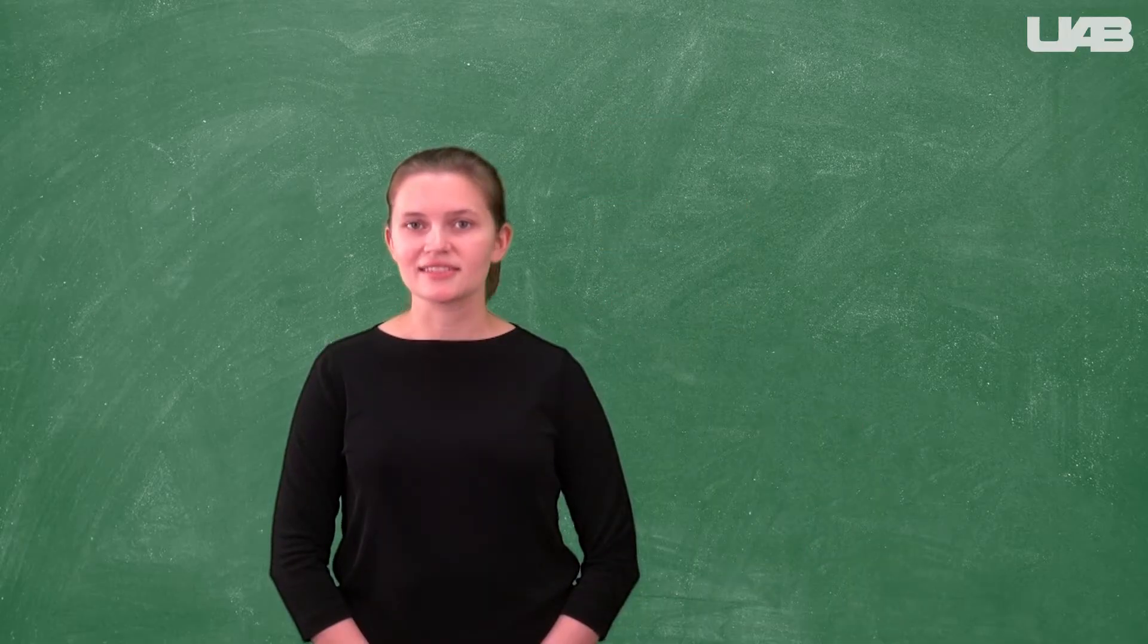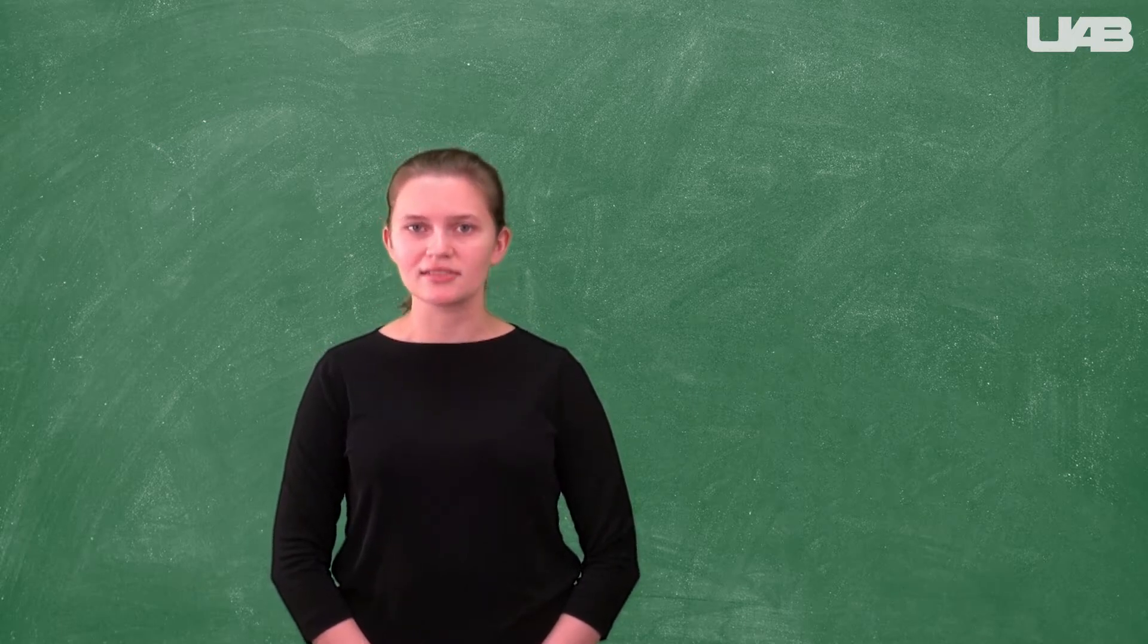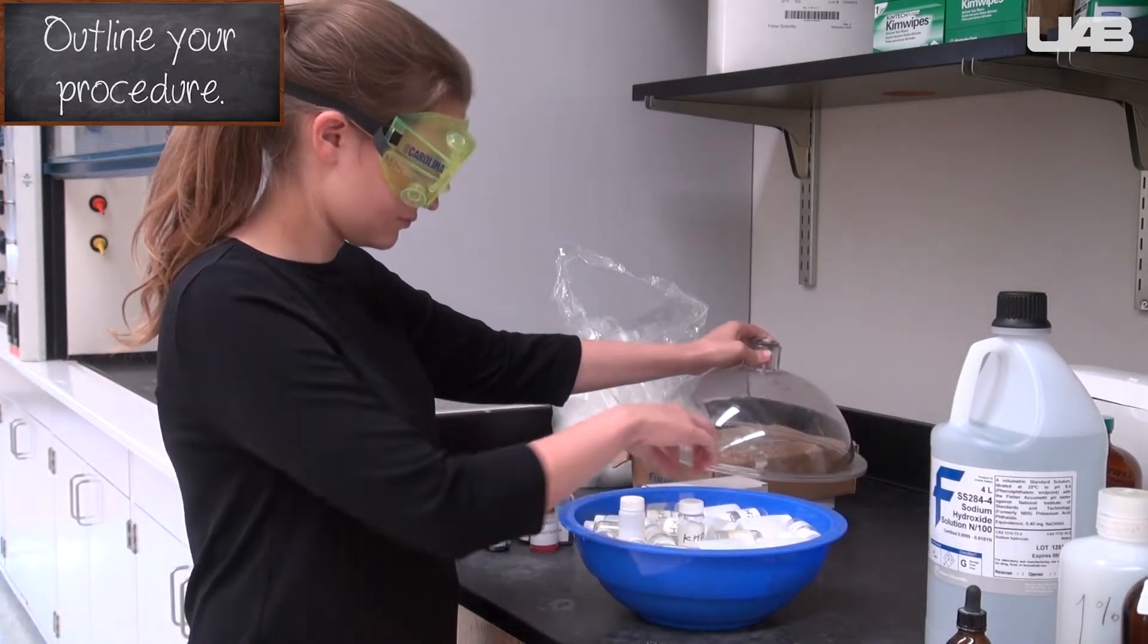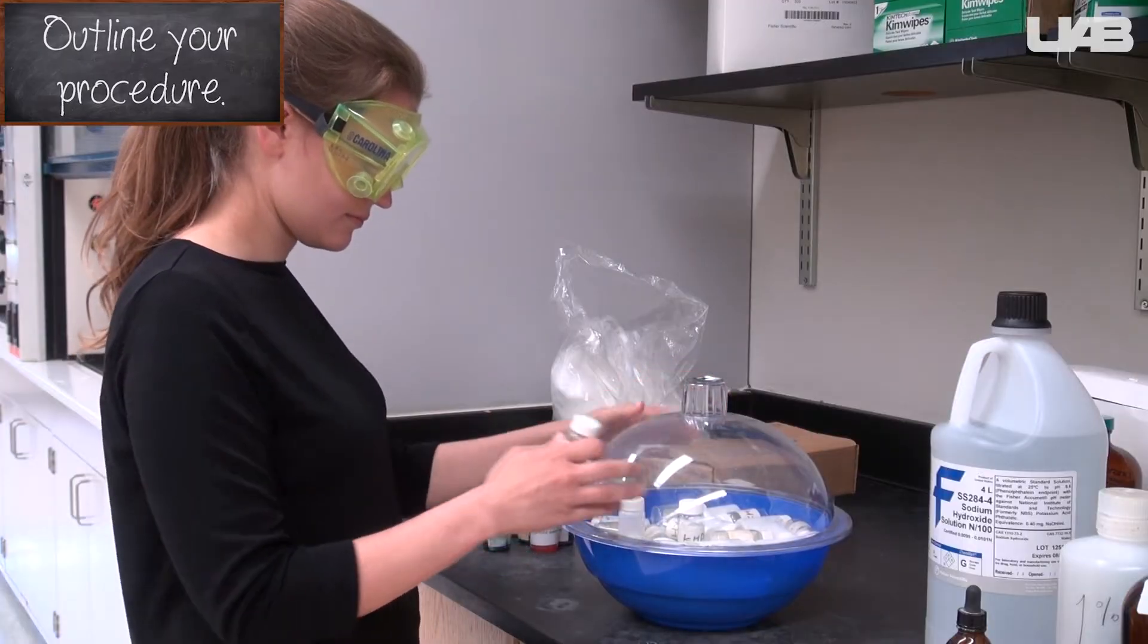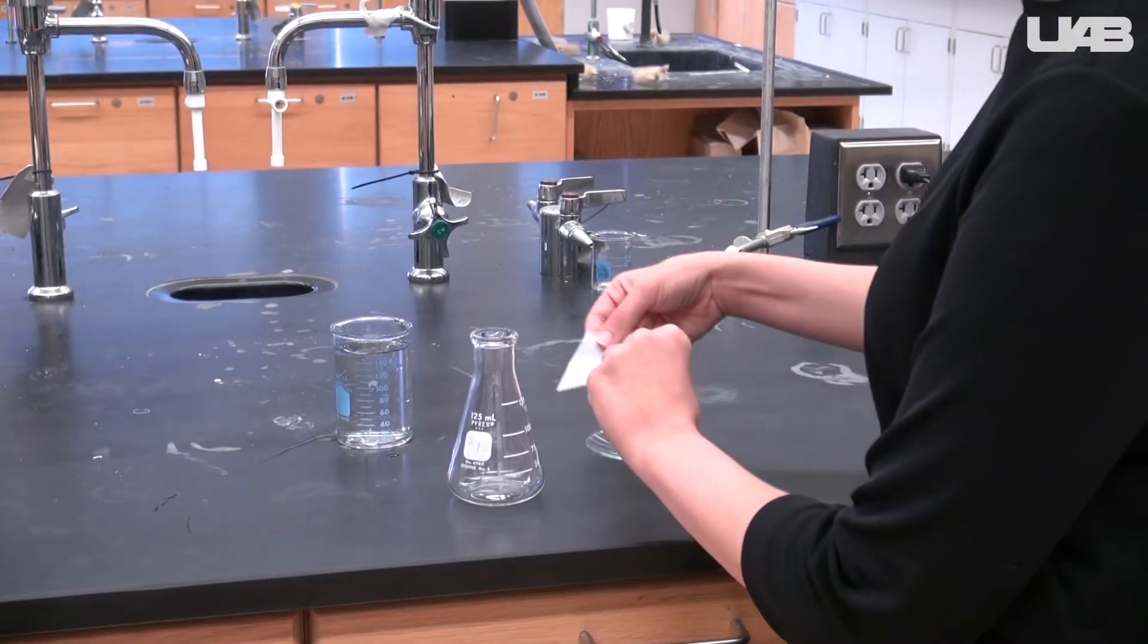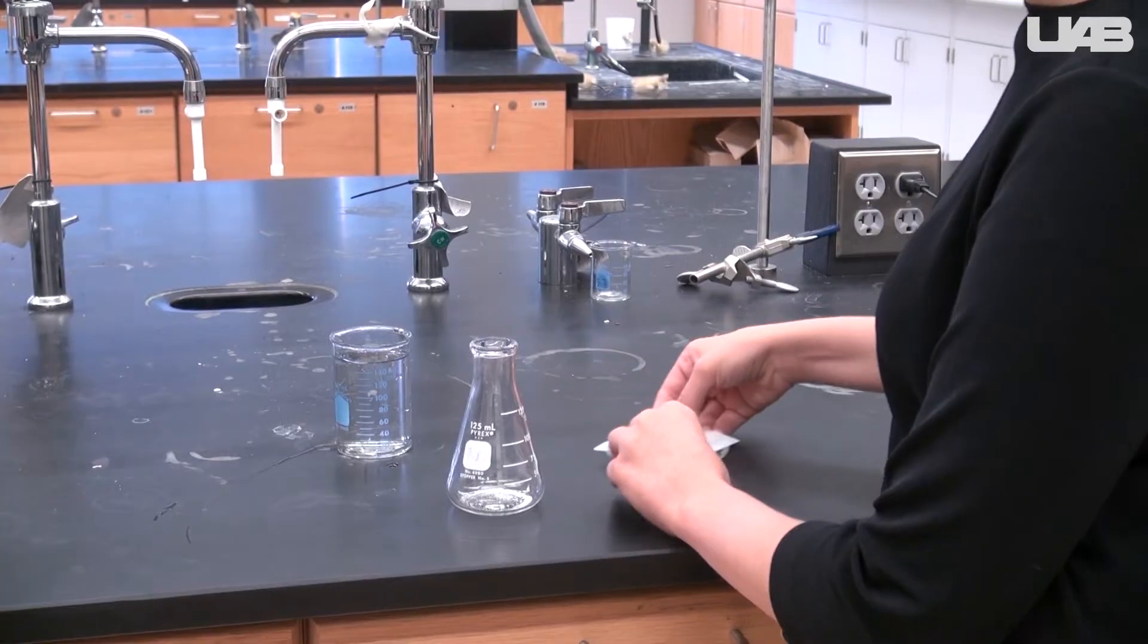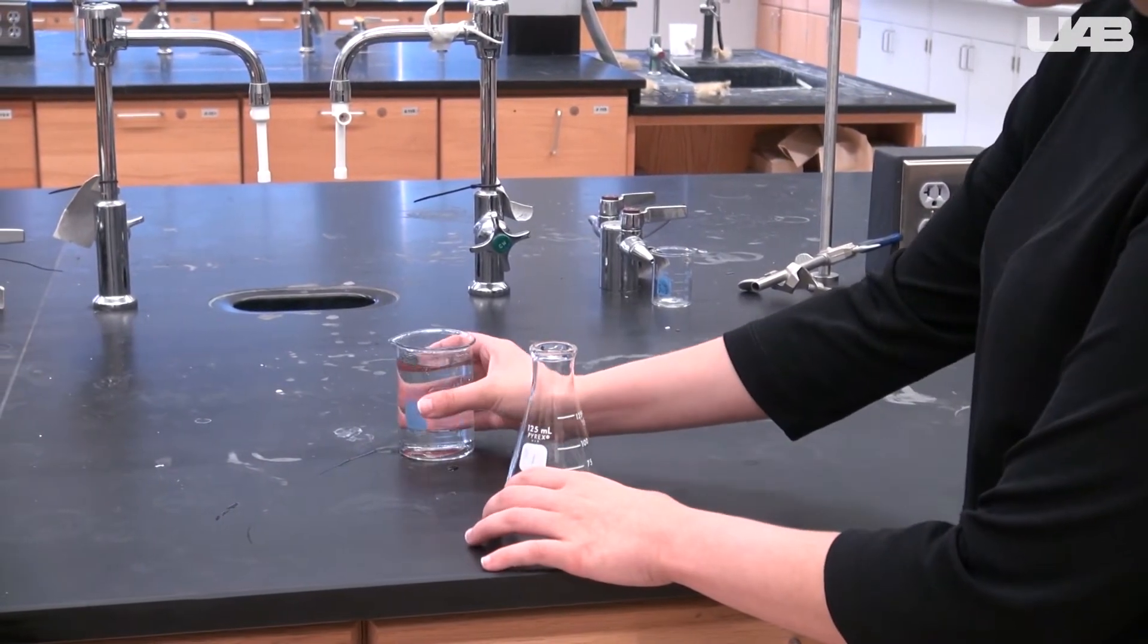While one person is setting up the burette, another can be preparing the KHP solutions that will be used to standardize the sodium hydroxide solution. KHP is kept in the desiccator with the blue base. Take a bottle of KHP and replace the lid. Find the mass of a portion of KHP and record it in your notebook. Transfer the sample to an Erlenmeyer flask. One of the calculations in the In Your Notebook section will tell you about how much KHP you should use.